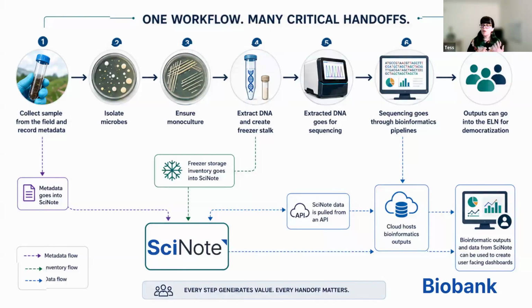After we collect the sample, we might isolate the microbes, including ensuring that we have a monoculture so that we can store that in a freezer inventory. And so this is where SciNote comes in again. We're able to create that freezer inventory, and biobanks often go on for years. So that freezer inventory can get really messy if we're not organized well.